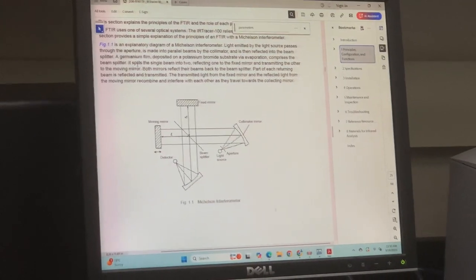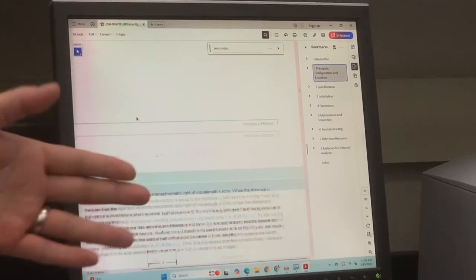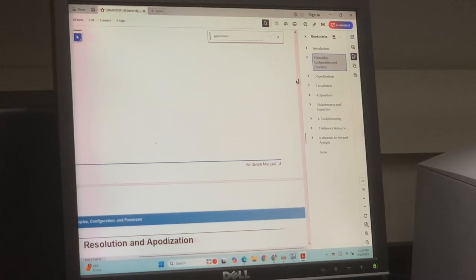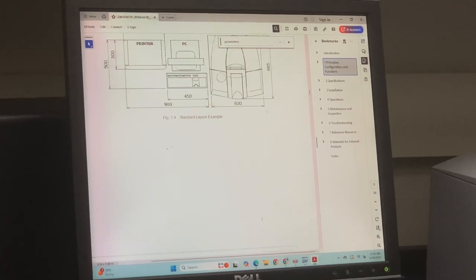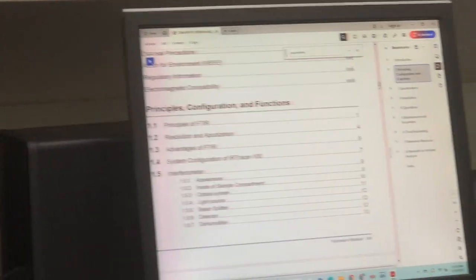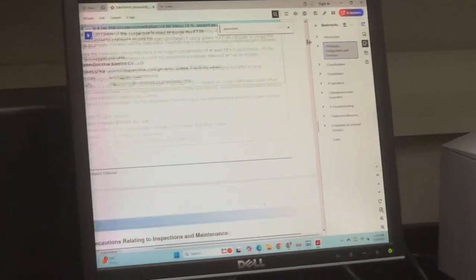Maybe it's just a schematic, but for the real setup, it's sitting in the middle. So I think it should be after. In the end, the people who design the instrument put the place where you put the sample in the right place, so you don't really need to worry about where it is in the diagram. Okay. Yeah, just drop the sample in the place.